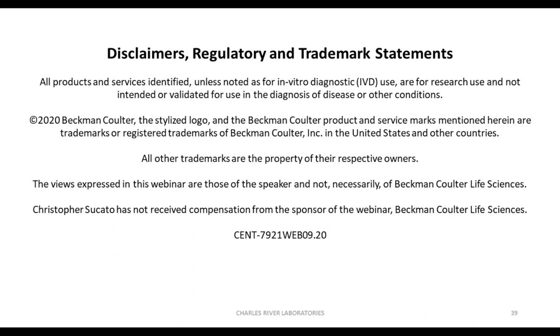So let's get started. The first question we have in is as follows. This is a question about experimental consideration. How much AAV sample would you need to do a basic characterization assay? And how much would you need for a full validation? Over to you, Dr. Sucato.